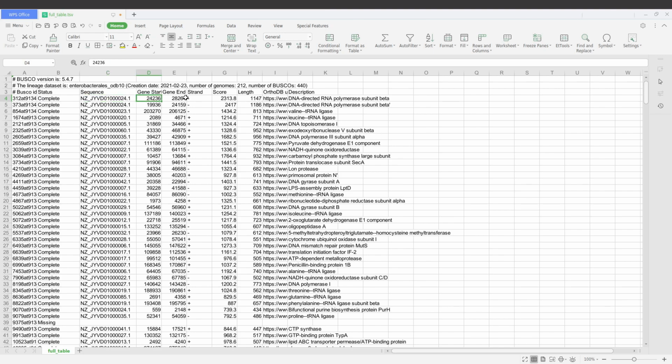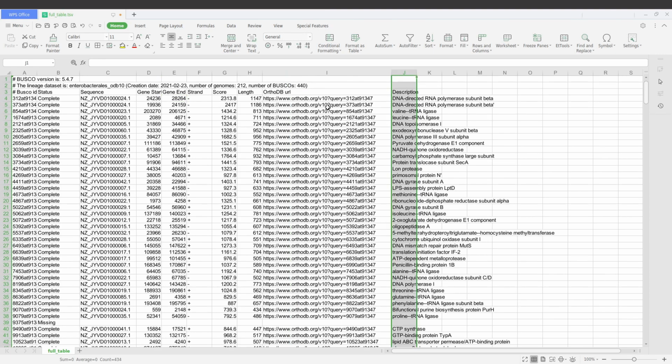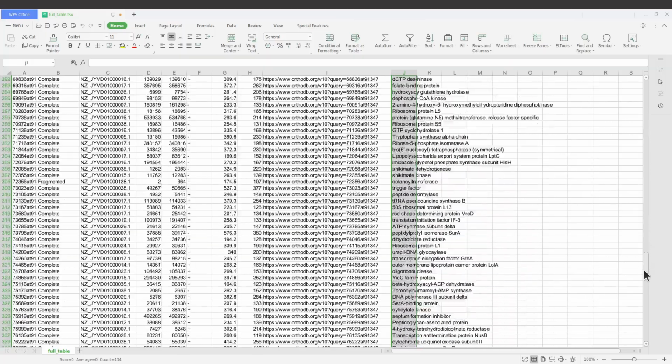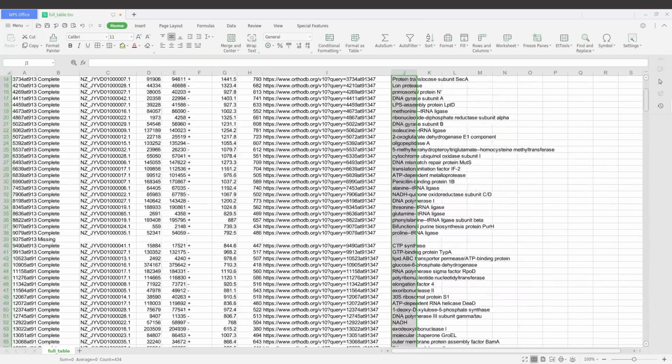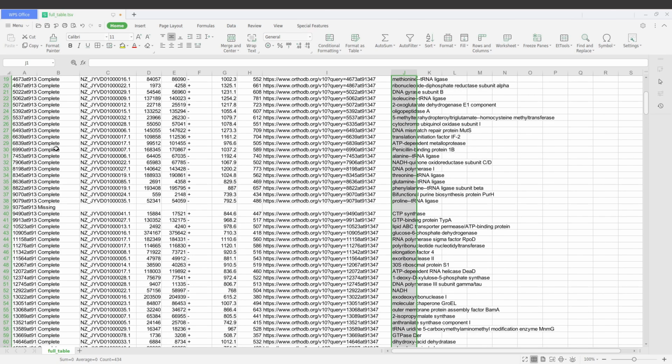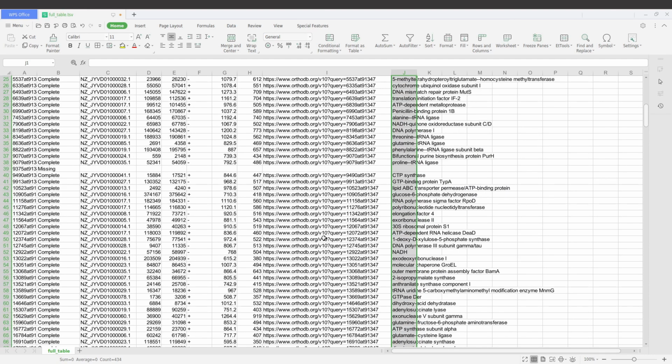We also have the gene start and end, strand, etc. We also have a link here that you can use if you want to look the BUSCO hits up. Just scroll down and then we see all of them here. So complete, missing.